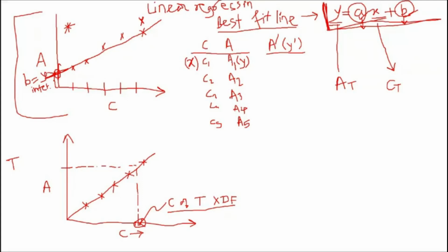So today we are going to calculate by both methods. In the second method, that is by equation, also you need to multiply that concentration by the dilution factor to get the original concentration.